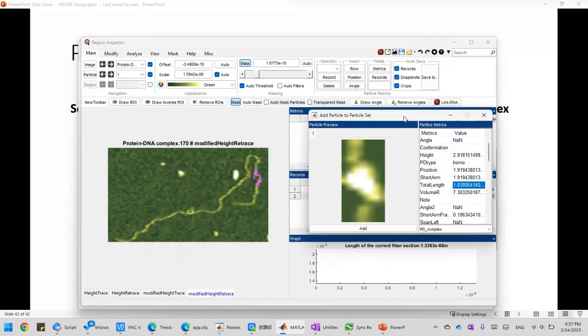We have this particle. And the reason I include a little bit of DNA arms flanking this protein complex is because I want to know its DNA binding context. So when I view the particles individually, like for example, in particle classifier, I can see how it bends the DNA, right? Because I have the DNA arms included in its image as well.